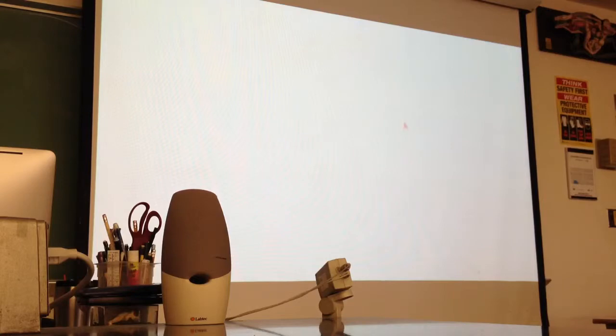There we go. Well, there's this specimen.